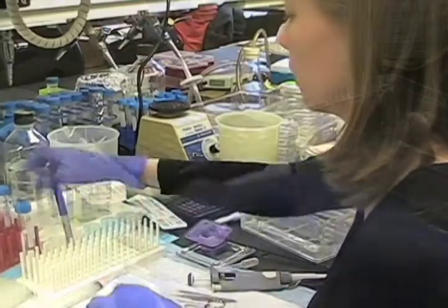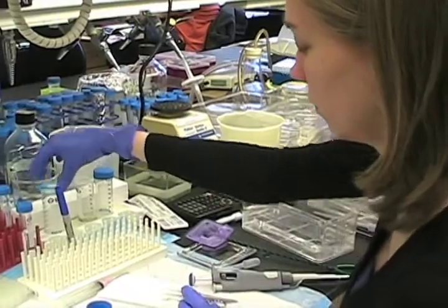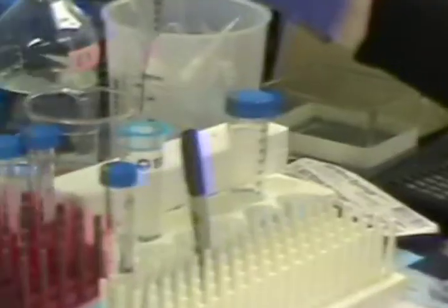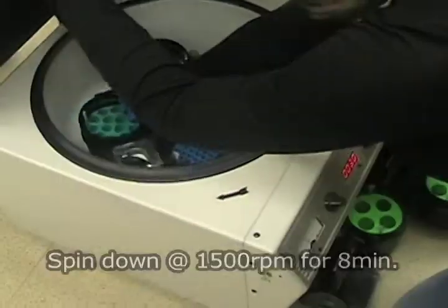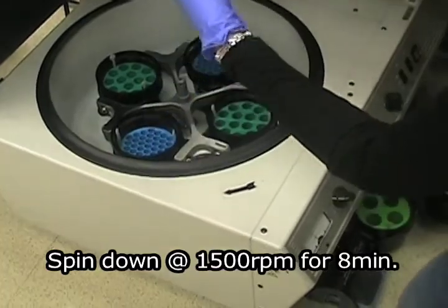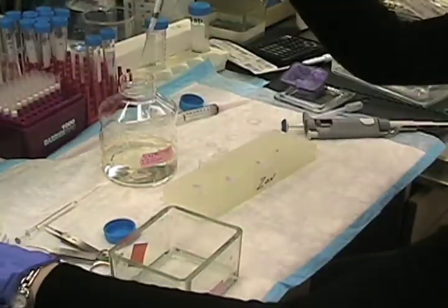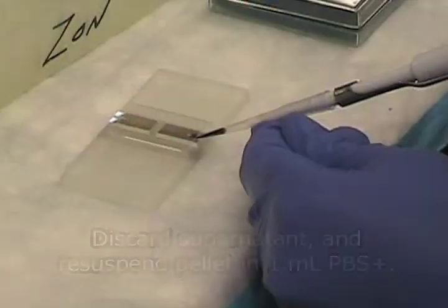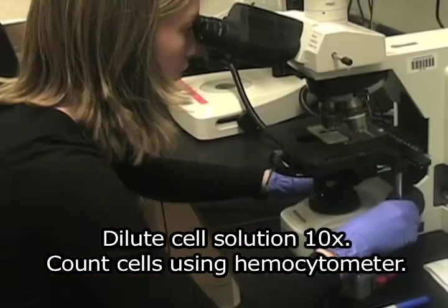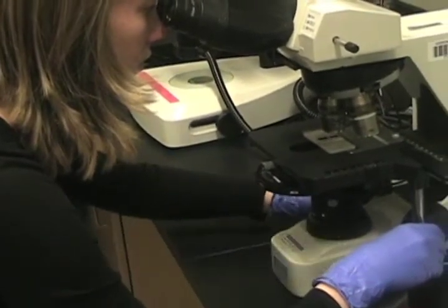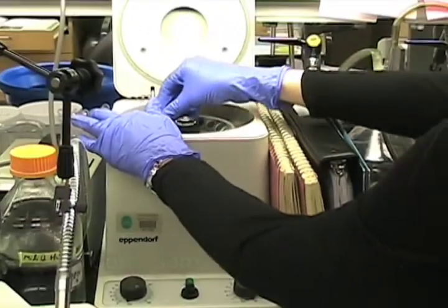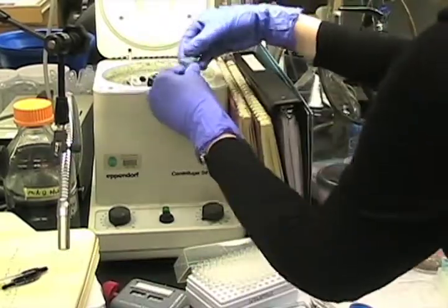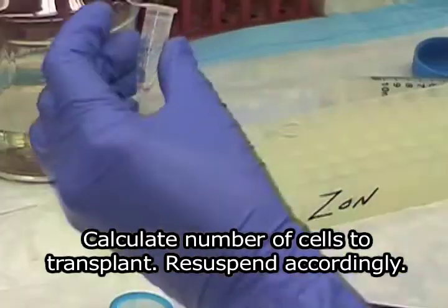Use a 40 micron cell strainer. Strain the cells, and that will catch any big pieces that you have. Pour out, resuspend in 1 ml PBS plus. Count cells. Calculate number of cells to transplant.